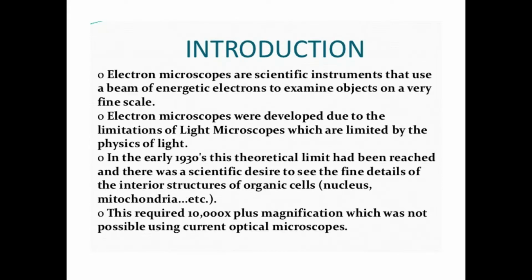But in the scanning electron microscope we can go to 10,000x also. You will get nice images, no problem: microstructure, single grains, etc. You can focus on it, and this is applicable to metallic as well as non-metallic samples. For non-metallic samples we have to take some precautions, which we will see in upcoming slides, not an issue.